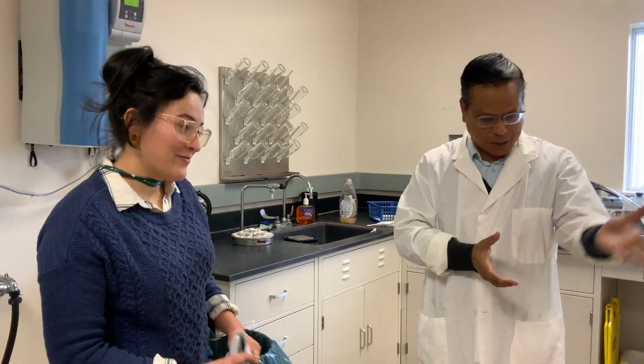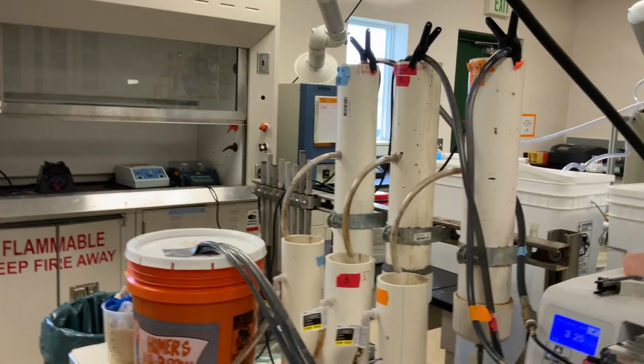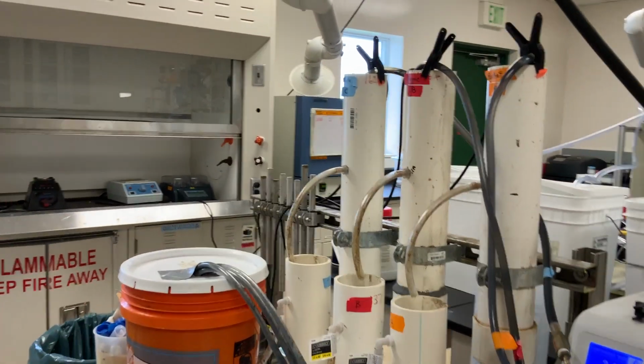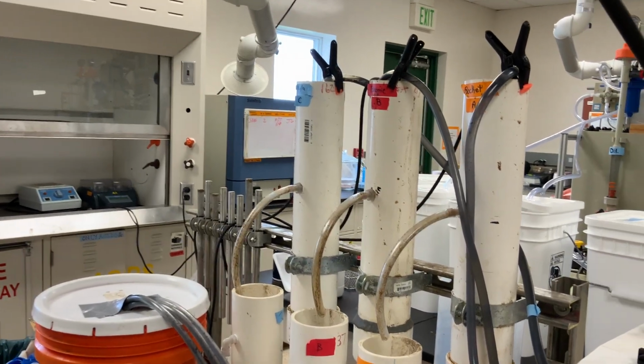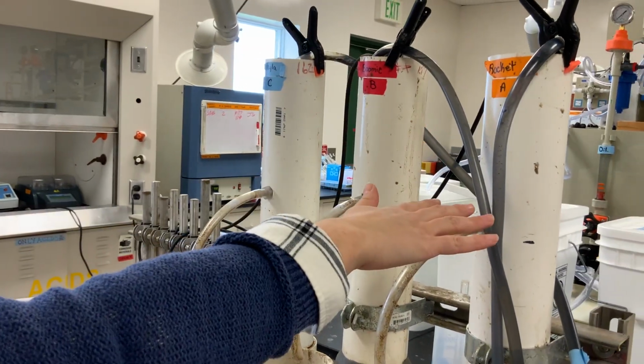Yes. Thank you. Please explain how you're working. Yes, so this is a small wastewater treatment plant, a mini wastewater treatment plant. These 3 reactors are running in triplicate, so they're not connected in any way to each other. What's happening here is I'm using activated sludge. I've seeded activated sludge from the East Lansing wastewater treatment plant into each one of these reactors.